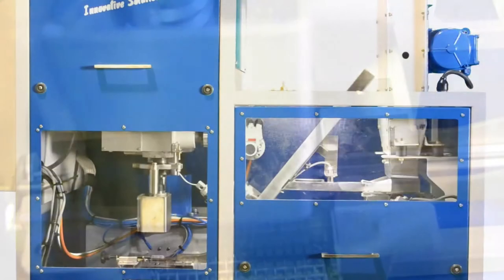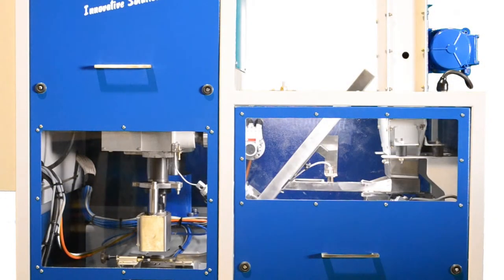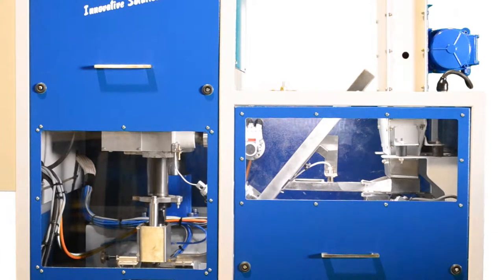The briquette is placed underneath the drill with the use of a pneumatic cylinder. Once the briquette is in place, the drill moves down with the assistance of a servo motor and starts drilling the sample.